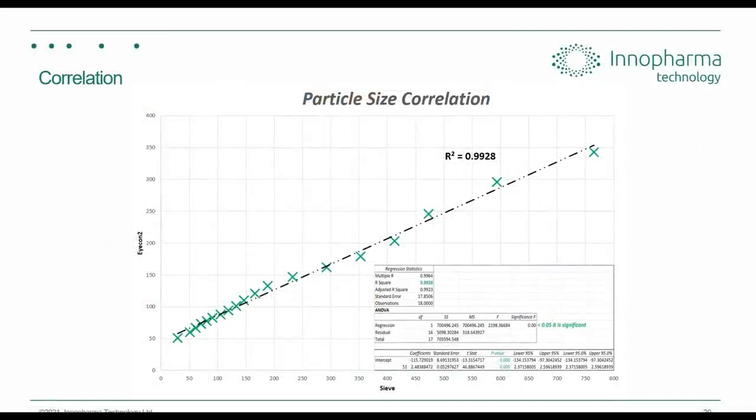There we go, cool. All right, so we moved on from the lab tour. We've covered a little bit really about correlation and regression analysis. I did mention, this doesn't have to be done via Excel. It can be done via your statistical package of preference. You might have something already existing in your company. But just because there's a straight line on the graph, that doesn't necessarily follow that the one thing caused the other. There's the classic saying, correlation doesn't imply causation.